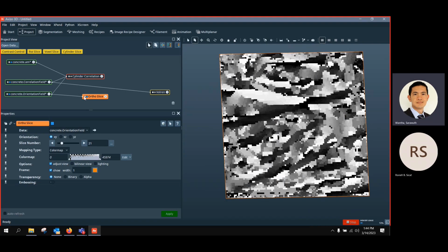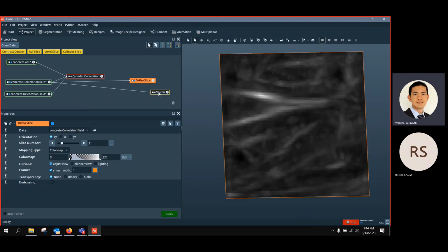One thing we need to understand is that because we work on the correlation score of the bright and dark and the contrast, we need to estimate the correlation score where we're going to start detecting where the correlation is a fiber or not.